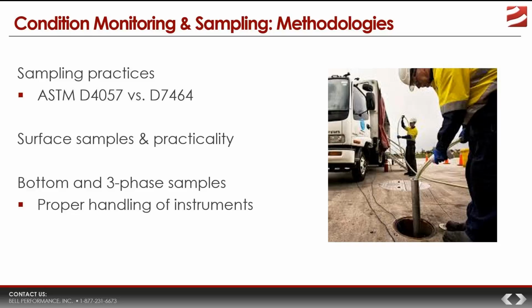Now, the old school method, if you ask the fuel microbiologist, would be to dip the tools in alcohol, even ethanol, and flame them, and that sterilizes them. And yes, that absolutely does sterilize them. But flaming tools like that out in the field is not something you're really going to be able to do if you're around fuel.